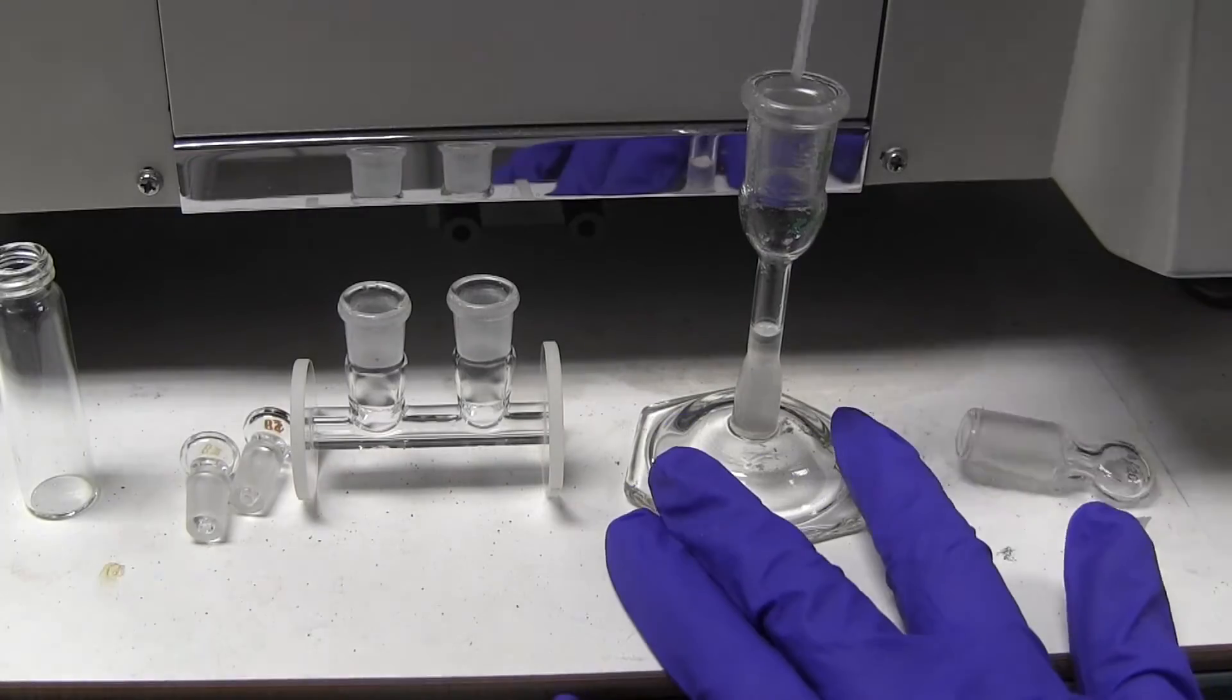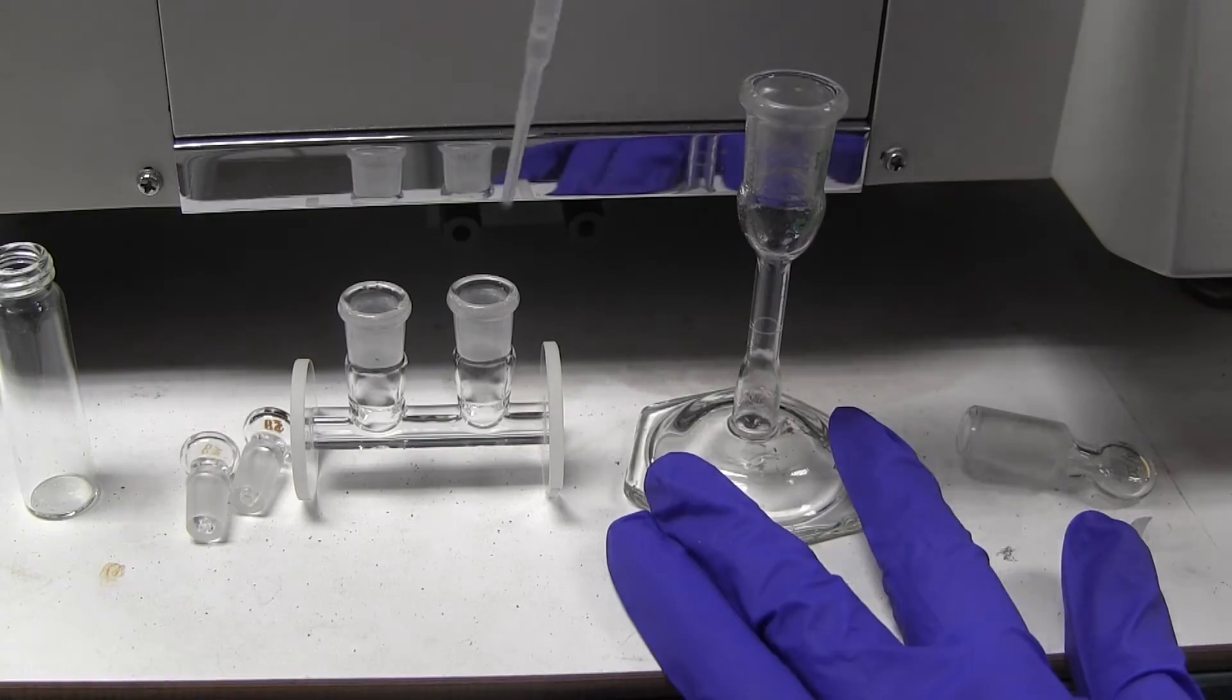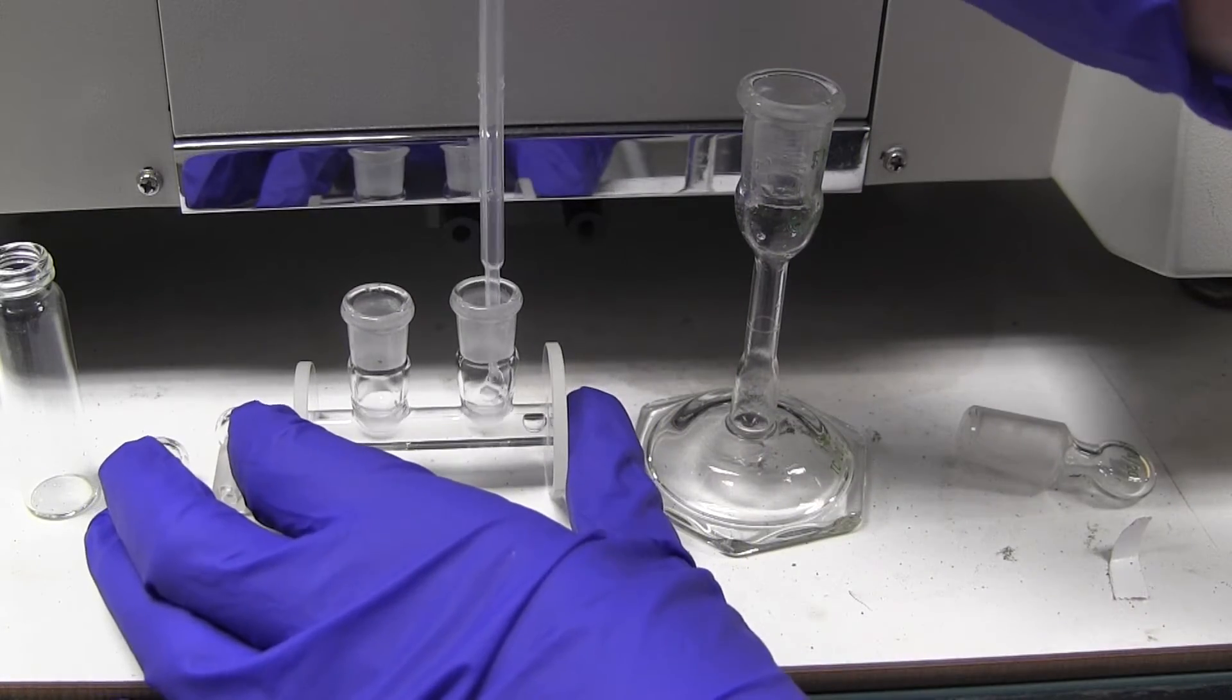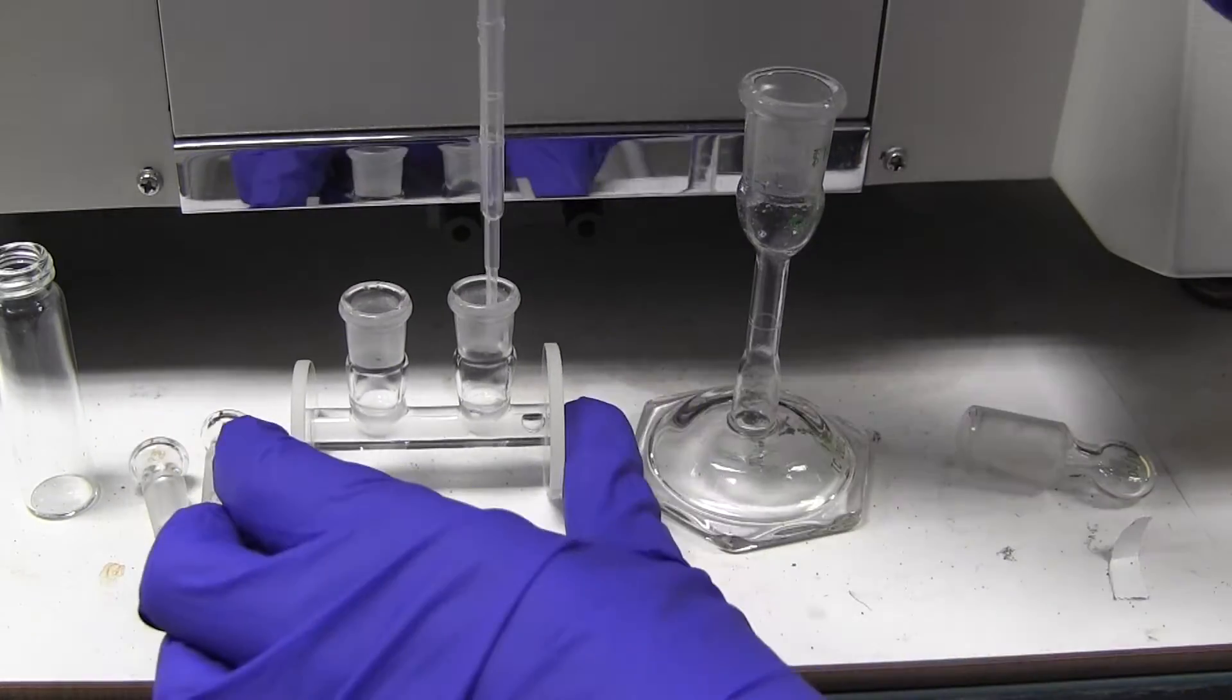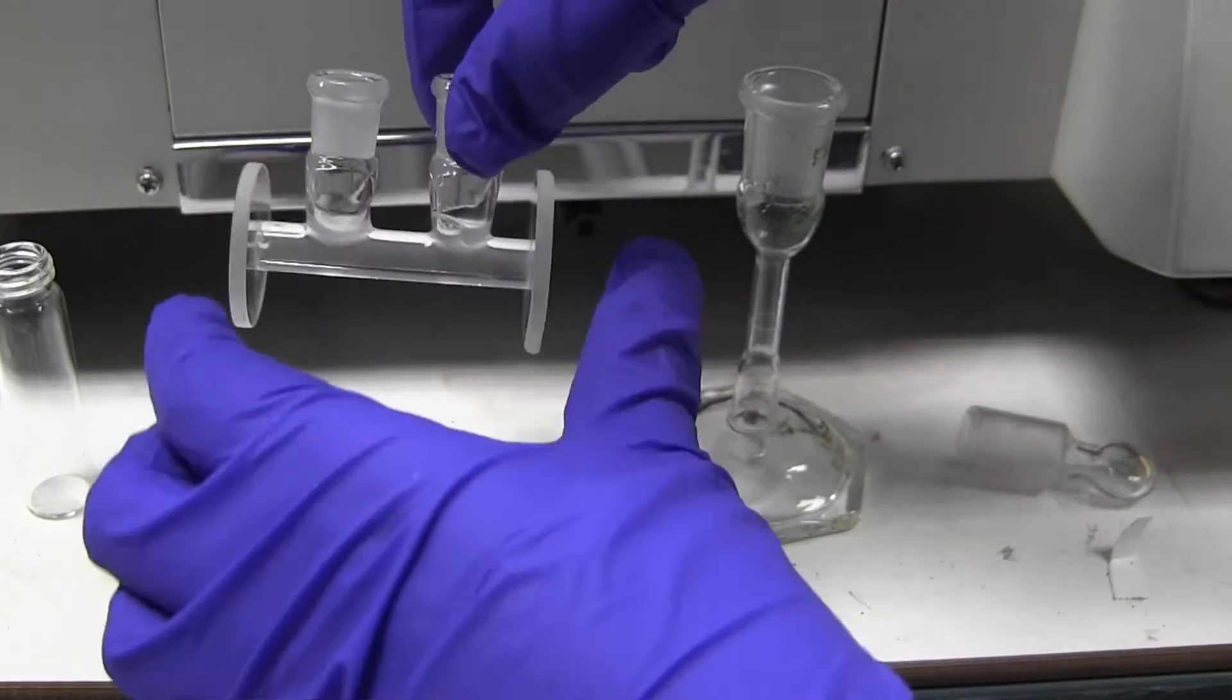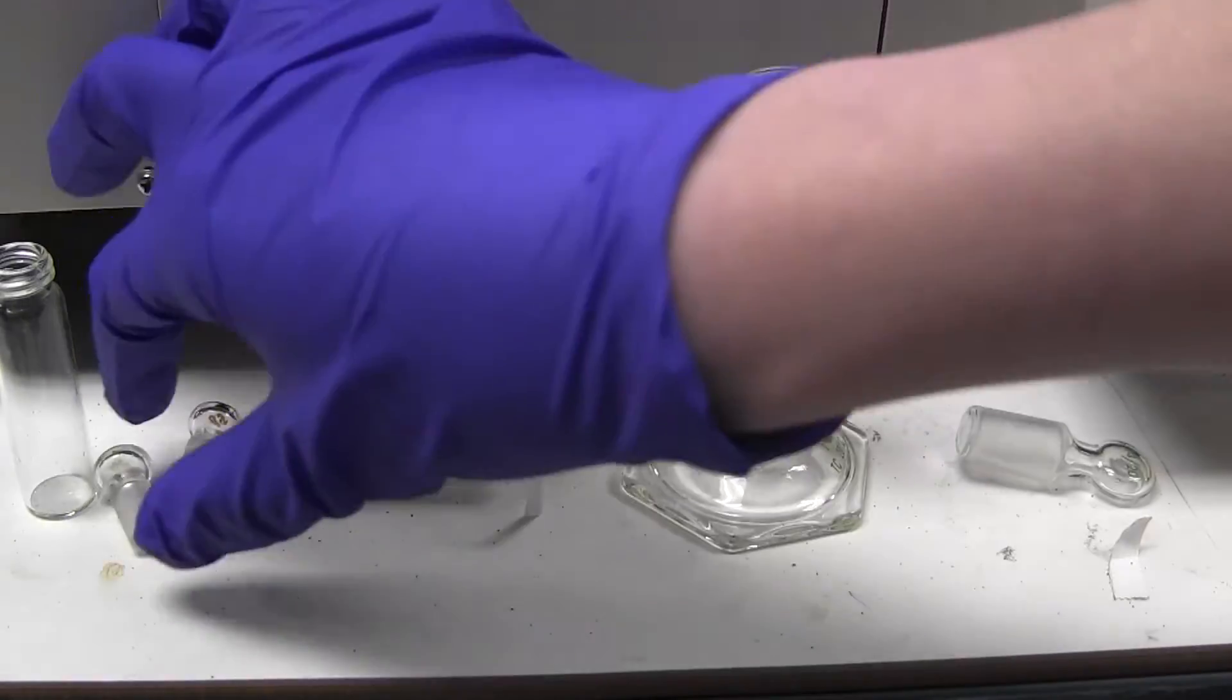Transfer this solution into one of the polarimeter cells and make sure that there aren't any bubbles in the tube. Be very careful with these cells, they are very expensive. Make sure there aren't any fingerprints or other marks on the ends of the cell as well.